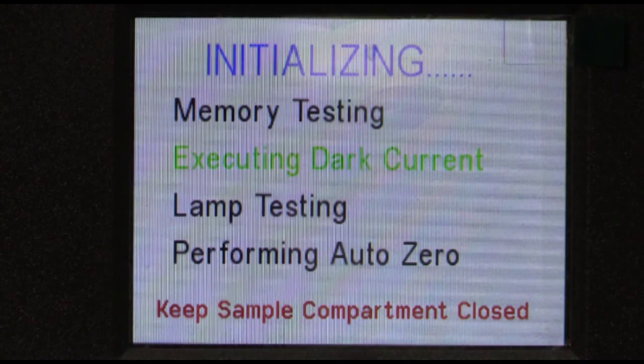Now during the initialization process, it's very important that you keep the compartment closed at all times until the process is complete. As it goes through the different steps, each step will be highlighted green.